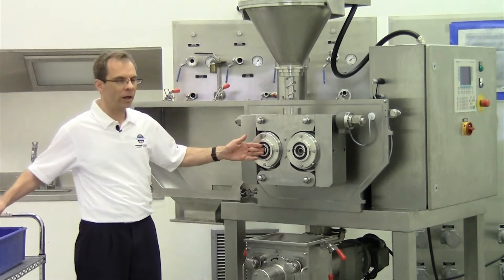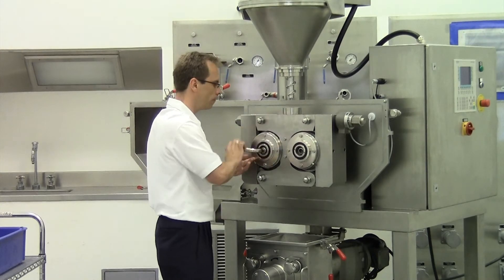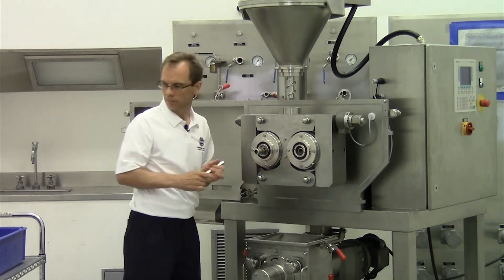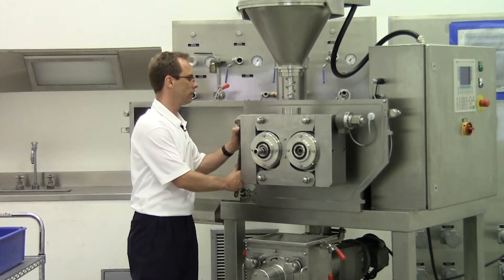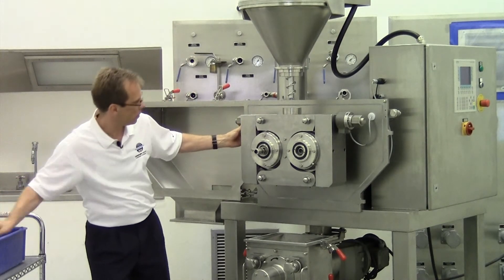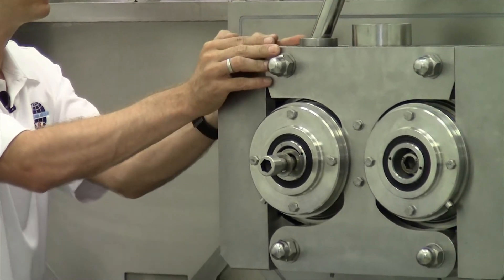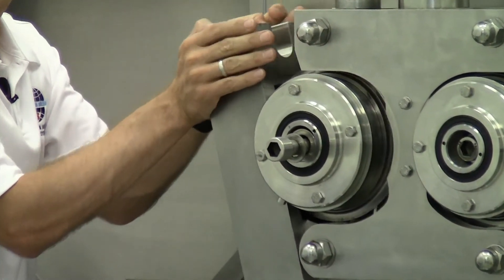So first of all I have to open the coupling. After that I can also open the nut here. Now easily the roll can be taken out of the machine.